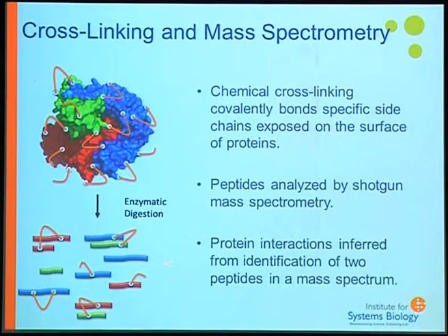As you've learned with cross-linking, the whole goal here is to try and understand the three-dimensional process by which the proteins are actually coming together. And by having cross-links, you can then get this spatial arrangement. If that peptide is linked to that peptide, they must be very close together, and so you can understand how that topographical location is really done.